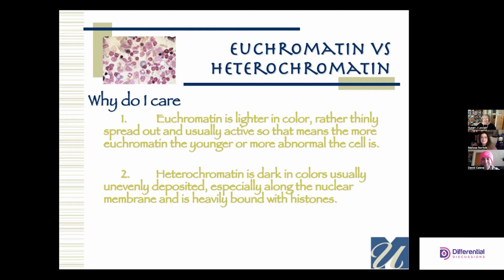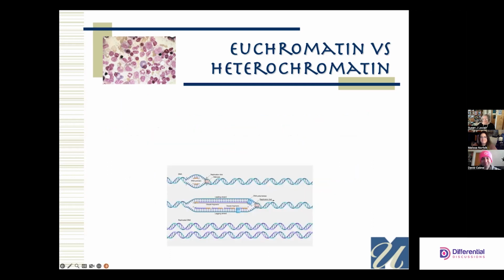And eventually, you will change from teenager to adult. That's not something you can go back on. It's a one-way trip. Lymphocytes, on the other hand, can be full of euchromatin, and then they can collapse in on themselves, and they can have a lot of heterochromatin. And that's a kind of a resting state for them, because they alone can move from heterochromatin back to euchromatin. And it's part of the process we call reactivity or immune response in them. So they, as usual, cause more trouble than the others do with maturation.